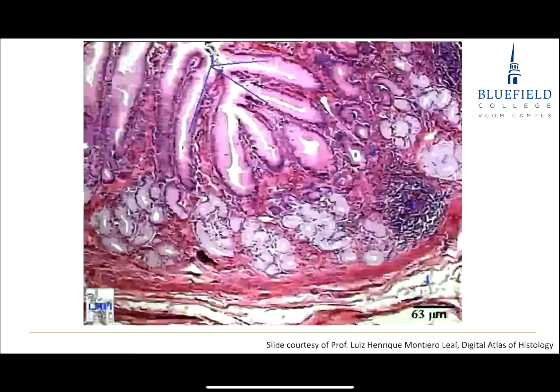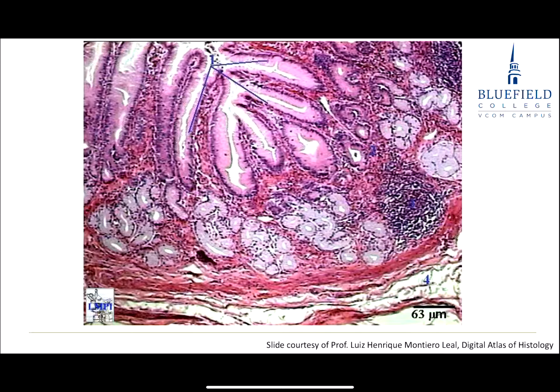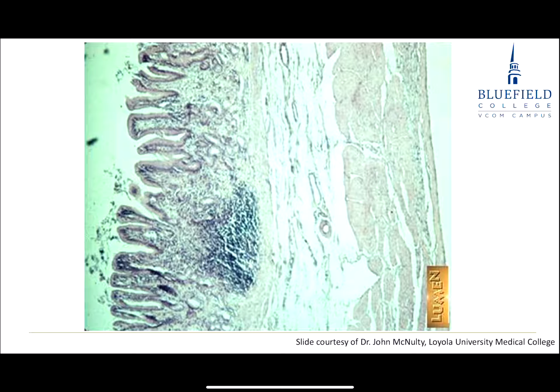This is pretty close to being nodular. I mean, it's not always black and white, nodular or diffuse. This is getting enough where I'm seeing a nodule, starting to see a nodule there, starting to see a nodule there. So that's pretty close, if not yet being nodular. Okay, same kind of thing here. See, I've got an epithelial lining up here, little villi from the small intestine coming off. That's pretty close to being a nodule, isn't it? Okay. Continuum really from strong diffuse into nodular.